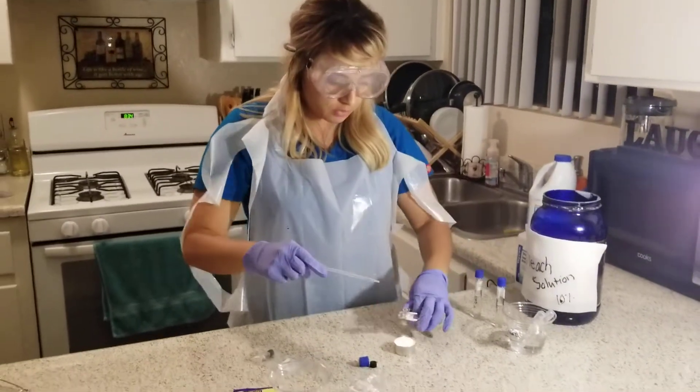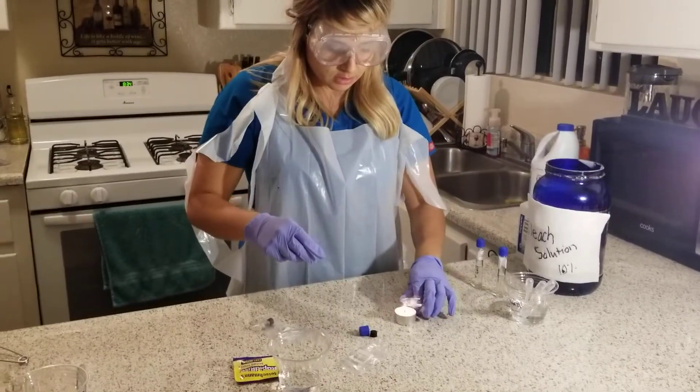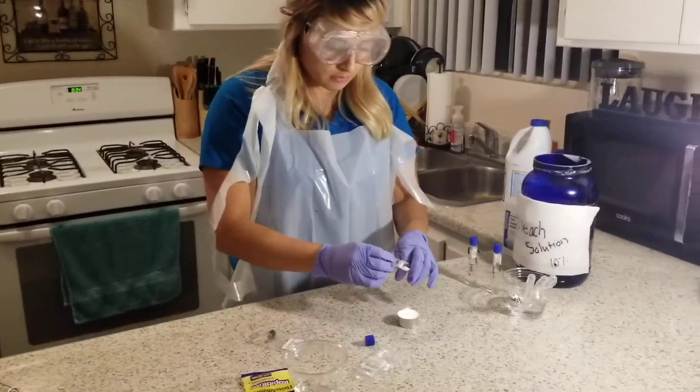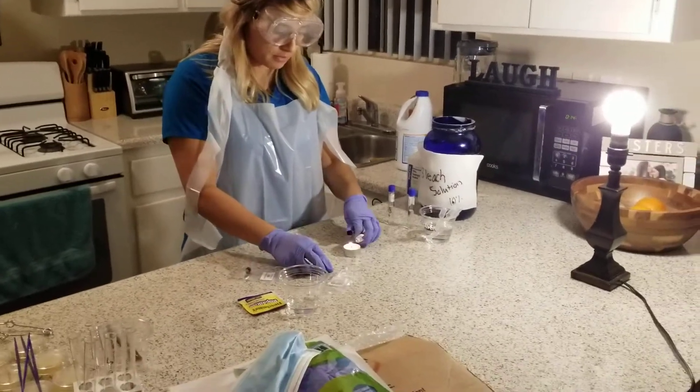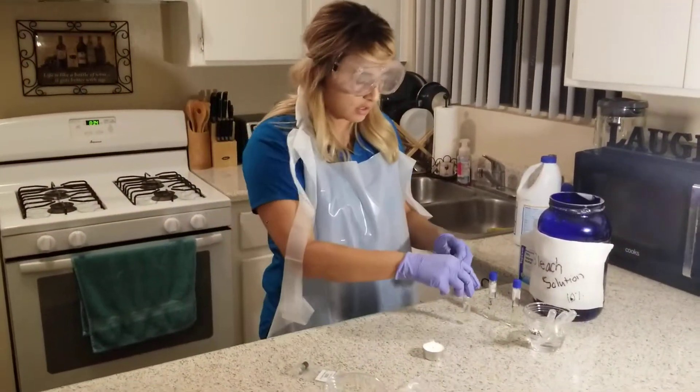And then I'm going to once again sterilize the tubes and recap to prevent contamination.